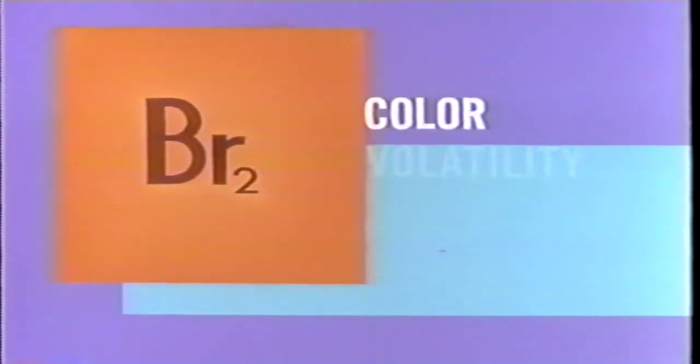Now let's try to obtain elemental bromine from seawater, making use of our knowledge of the properties and chemistry of bromine.